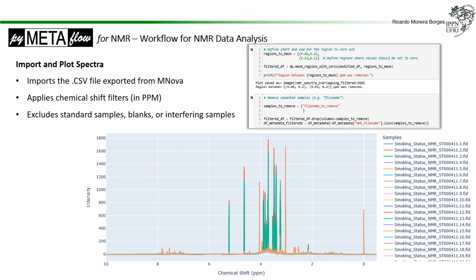Things like solvent, the peak of the solvents, or water from the solvent, or even the DSS. But I wouldn't remove the DSS just now, just because we can use it. We have to use it for referencing, and so, well, each case will have its own specificities.